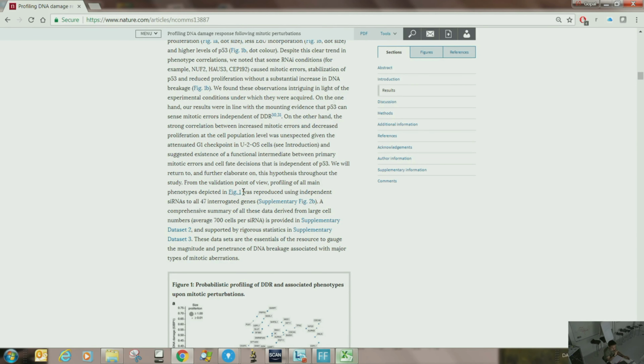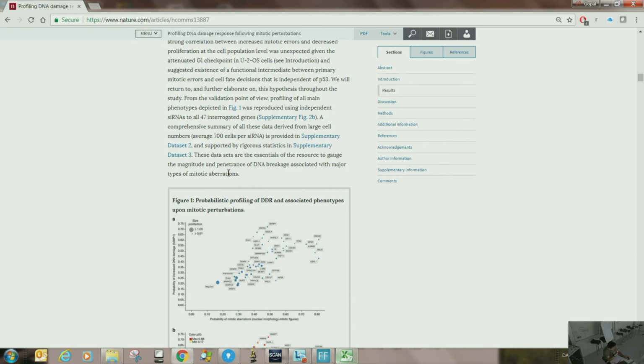And then we did some kind of machine learning, but that's a different part. What we did is basically, for every cell you get a probability, a likelihood, that the cell has a morphology which corresponds to 53BP1 damage or gamma H2AX or EdU. So every cell gets 3 probabilities from 0 to 1. If the cell is very similar to the 53BP1 phenotype, it would get more like 90% of 53BP1, 70% of gamma H2AX, and 50% of EdU, for example. If the cells are proliferating at that particular moment, then it's more like EdU.